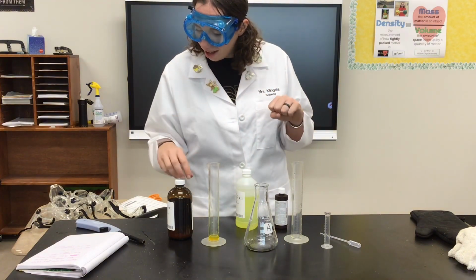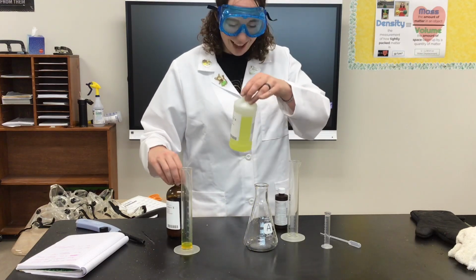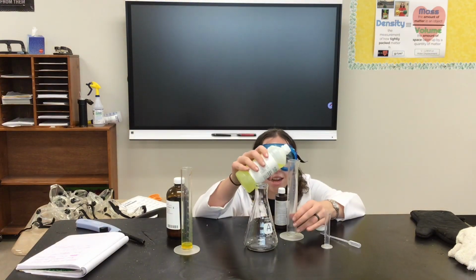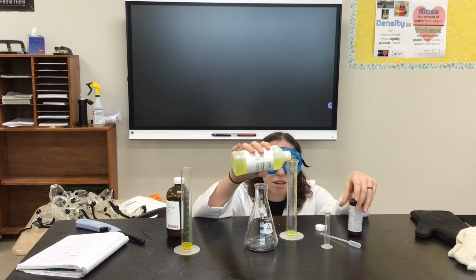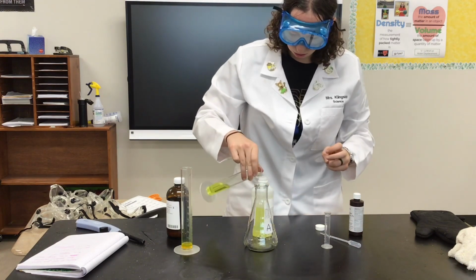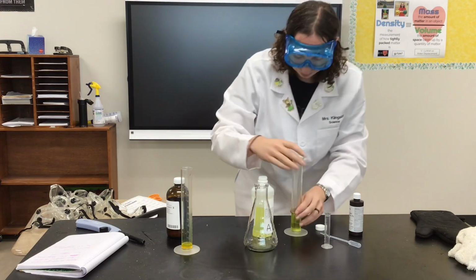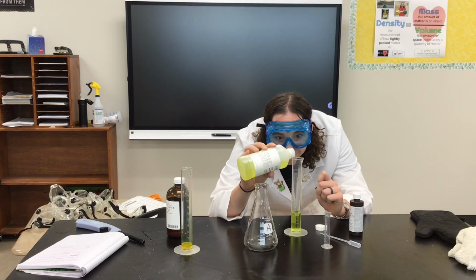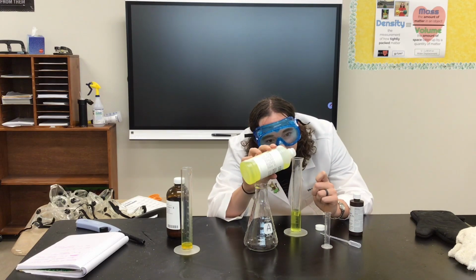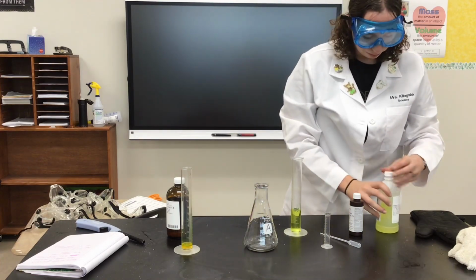So what we're going to do is I'm going to take 35 milliliters of potassium ferricyanide. So again, we're working with potassium. We've seen it a couple times. Potassium ferricyanide. I'm going to get 35 milliliters. I'm actually going to do a little too much. Perfect. All right, 35 milliliters.